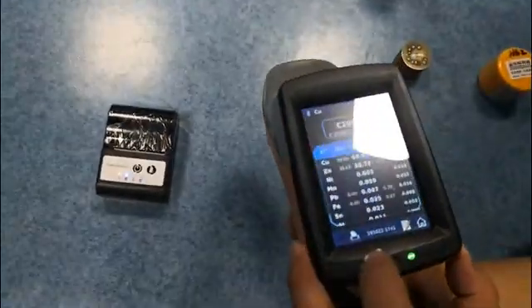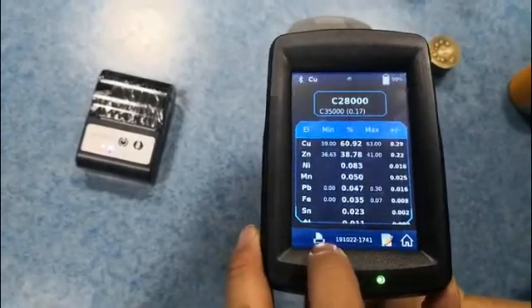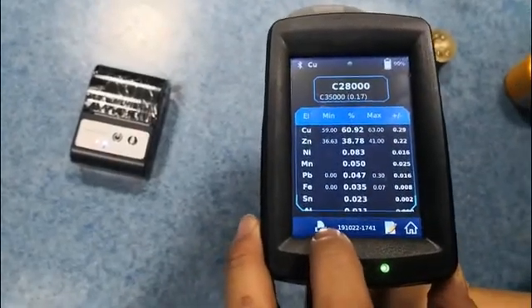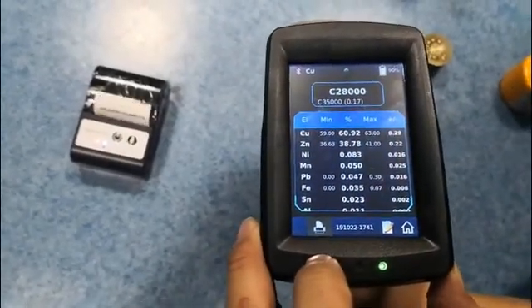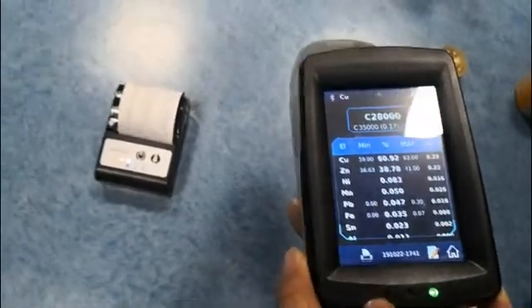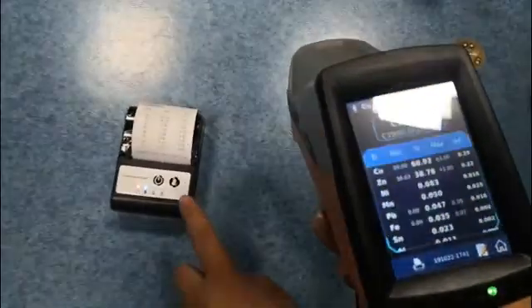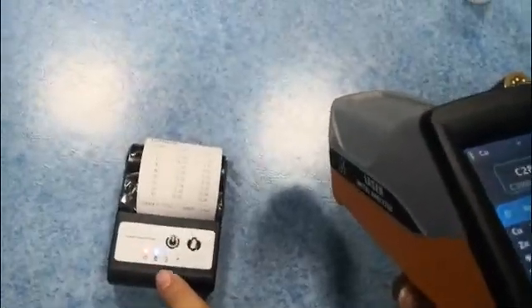Now we will show you how to use the printer. Here we click here, the printer will print out the result.